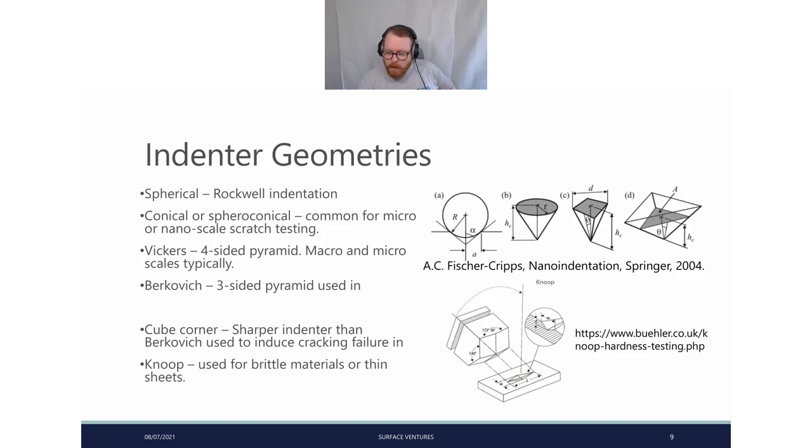So in terms of other roughness parameters, I think that's probably where you're going to use the somewhat standard suite of roughness parameters. So in terms of what can be used, I think that was probably where you're using Rq, the RMS value, Rv and Rp, essentially the heights above and below, and the peak to valley height. So Rz, skewness would probably also be quite useful for some additional information on that. That gives you a little bit more from the center line above and below, and essentially how much you have between asperities. Those would be what I would recommend.